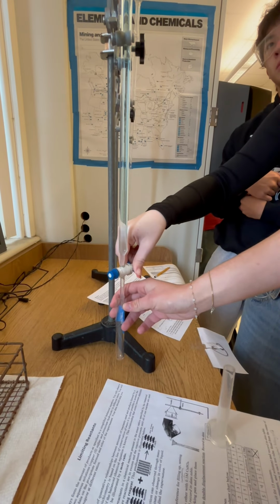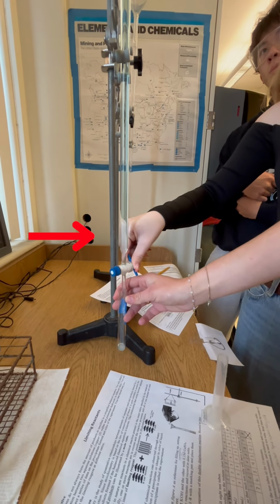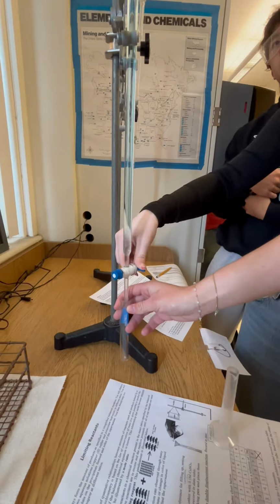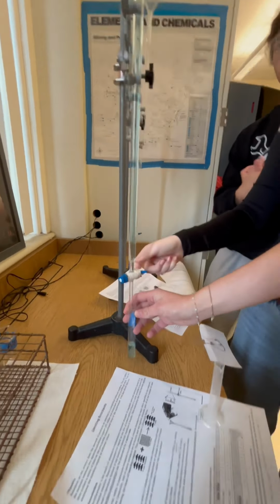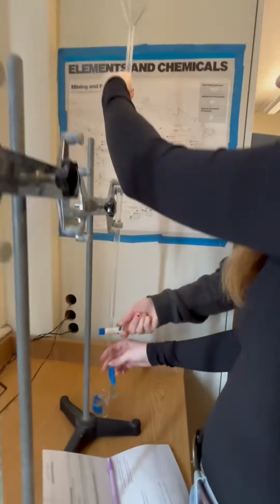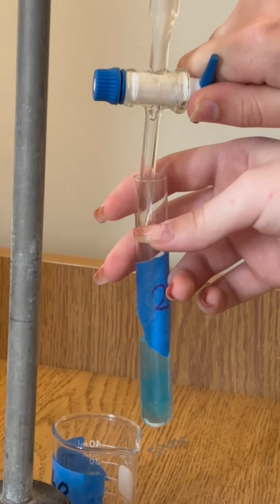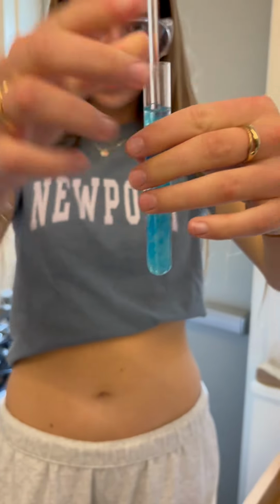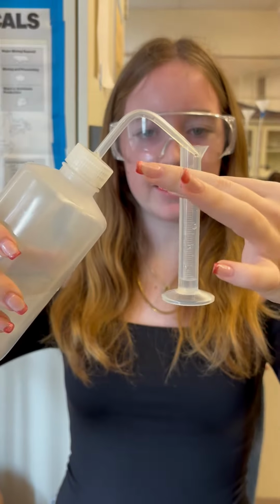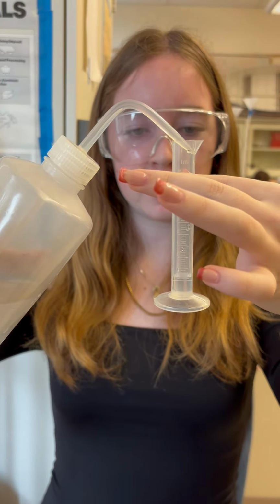To start, we used the chemical CuSO4 that had a water-like consistency with a blue tint, and KOH, which also exhibited a water consistency but was completely clear. We added 5 milliliters of copper sulfate to each test tube and then 1 milliliter of potassium hydroxide to test tube 1, 2 milliliters of potassium hydroxide to test tube 2, and so on. As the liquid was added, we consistently stirred and made sure the 2 substances were thoroughly mixed. Once all of the KOH was added, distilled water was included to even off the test tubes.